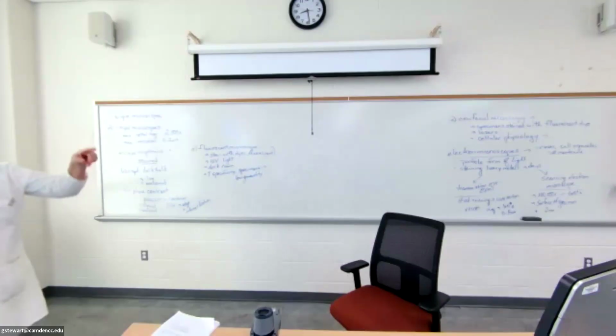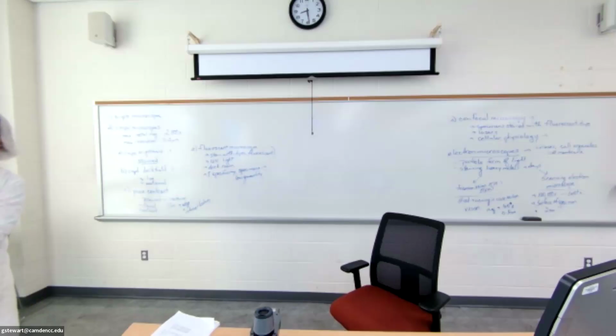So that is specifically, like I'm telling you right now, asterisk, star, red pen, highlighter. For this section, what you need to know for the test is you should be able to tell me the different types of microscopes, the dyes you might use, anything that's unusual about them, right? How you might stain a specimen, what the magnifications are, and what you would use them for.